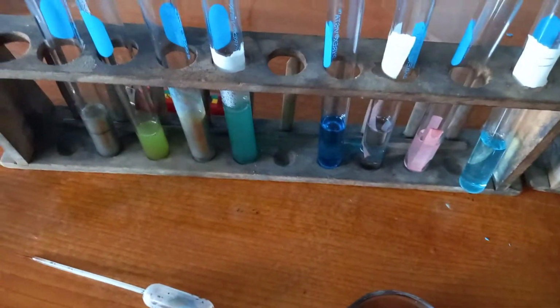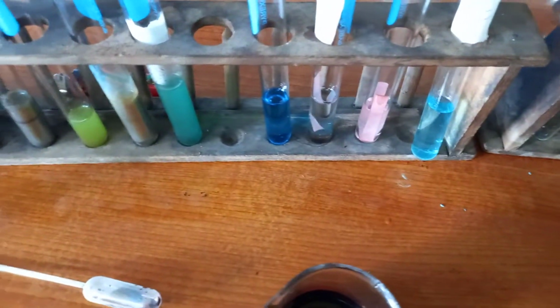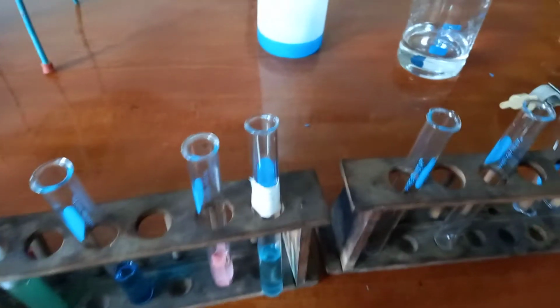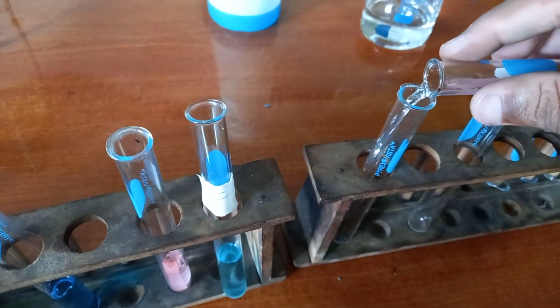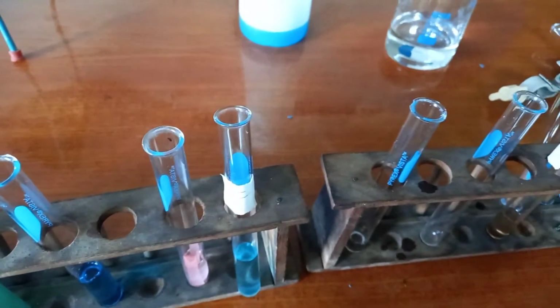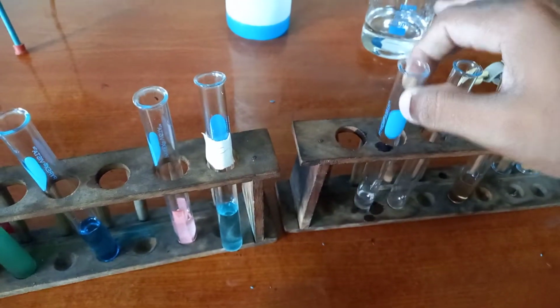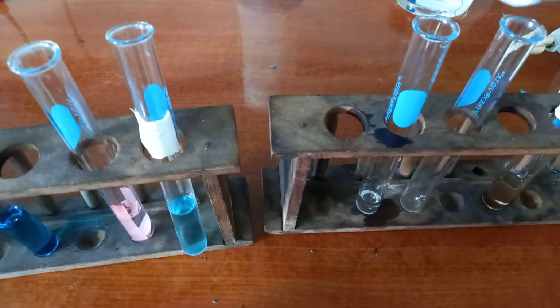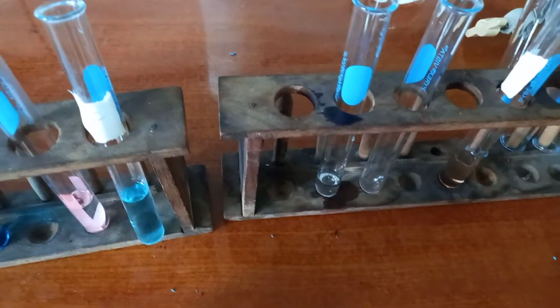So I'm going to get some sodium carbonate and add it to the container. I'm going to pour it a little in a new test tube, and I'm going to add this sodium carbonate.